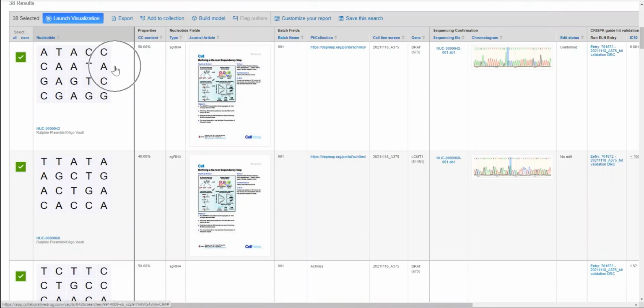In this particular vault, I have registered nucleic acid sequences. You can register these either one by one or in bulk using our bulk import data wizard. During registration, CDD Vault performs a duplicate check on these sequences, and all unique sequences are assigned a unique registration ID. If you happen to register a duplicate sequence, we will warn you and give you the option to create a new batch or sample of a pre-registered sequence. We will also calculate a handful of properties on these registered sequences, such as the GC and ATU content.